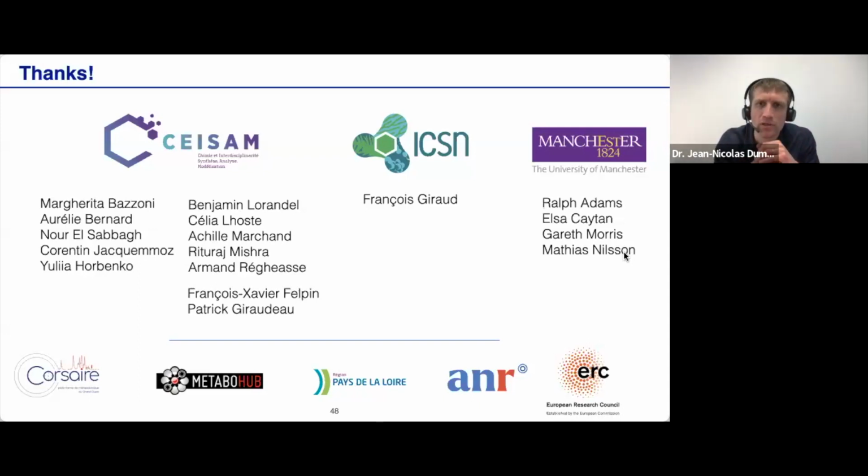For the diffusion NMR experiments in flow, we had to revert to sinusoidal shape, so they are slightly less efficient, but the experiment would still perform nicely. Perhaps the most sensitive choice is that of the gradient shape for the acquisition part of UF2D NMR. This one should rather be trapezoidal and well controlled, but it's not very sensitive, I would say.